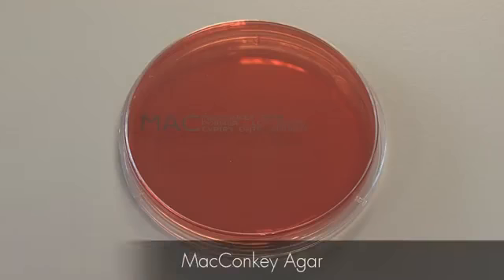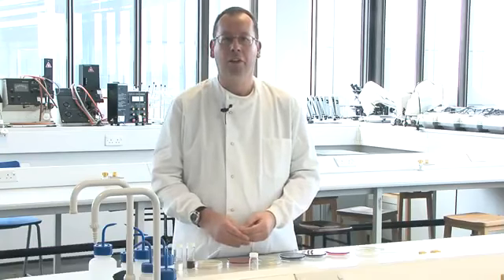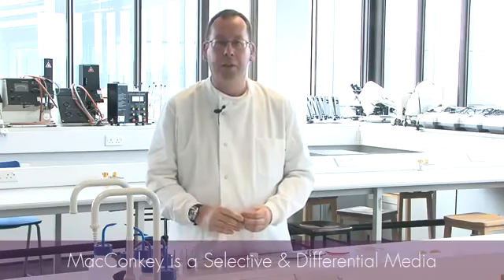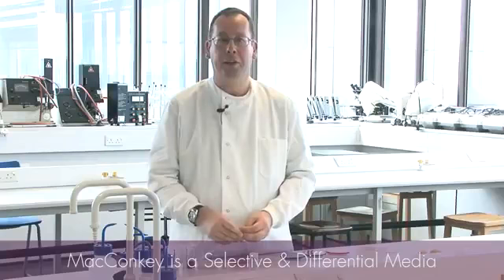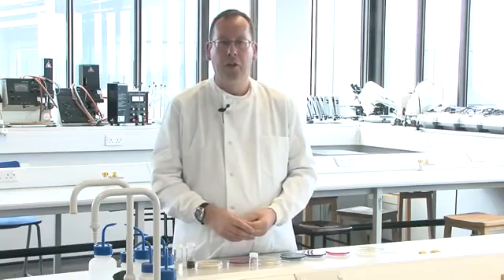Another selective medium is MacConkey, which is used in the isolation of gastrointestinal pathogens such as Salmonella, and those which are often found in the gastrointestinal tract such as E. coli. This contains bile salts, which inhibit the growth of many bacteria. However, MacConkey has another feature. It's not only selective, it is differential, which means it can be used to differentiate between similar bacteria which have different metabolic properties. And in this case, it will differentiate between bacterial species who ferment the sugar lactose with those which do not. And so, MacConkey is known as a selective differential medium.